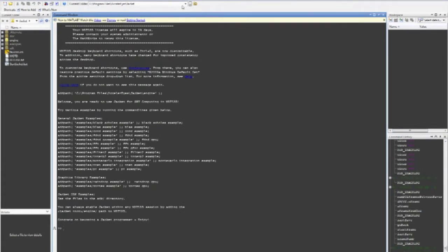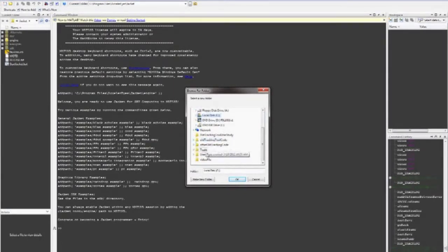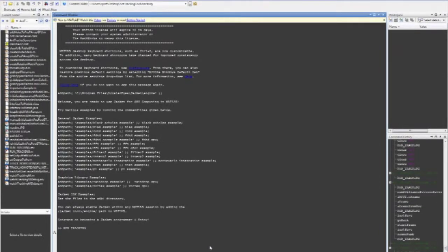Once MATLAB has fully loaded, please select the Browse for Folder button in the top panel. When the browsing window appears, find the Ant Tracking Tool folder and click Open. Once you have opened the correct folder, type RUN_Tracking into the command window in all caps, separated by an underscore, as shown on the screen. Then press Enter.